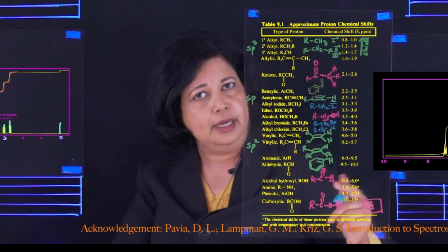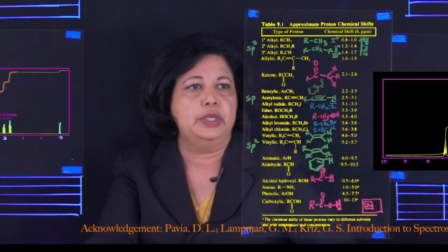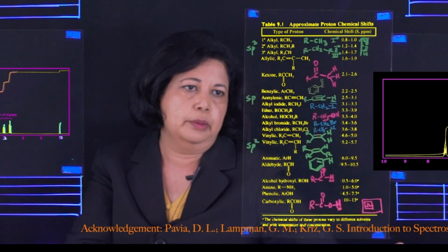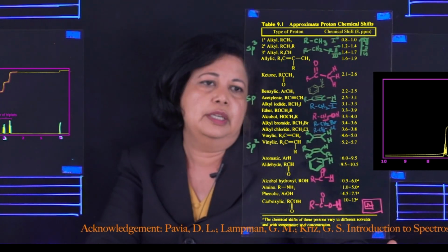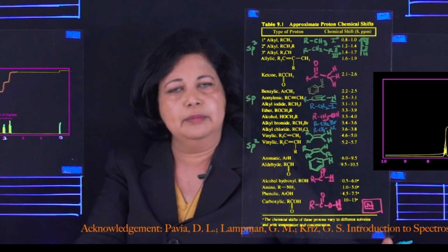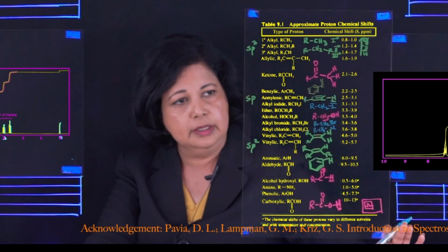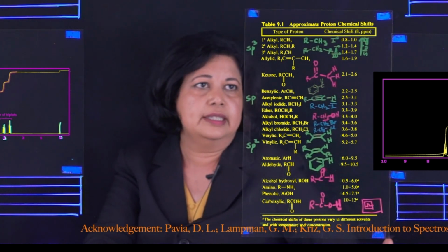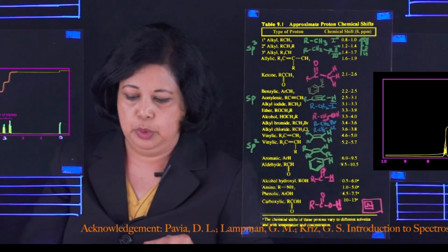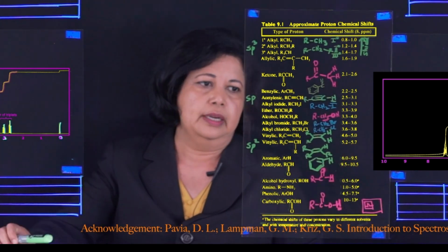So that trend really makes sense. So 3.6 to 3.8 when you have a CH2 with a chlorine. Okay, we don't have fluorine here, and fluorine spectra can be complicated because fluorine also has an odd number of nucleons, so we're not going to get into that here. Okay, so you can see that these are really the trends. The more electronegative, the more de-shielding, and the higher the delta value, and you kind of saw that.